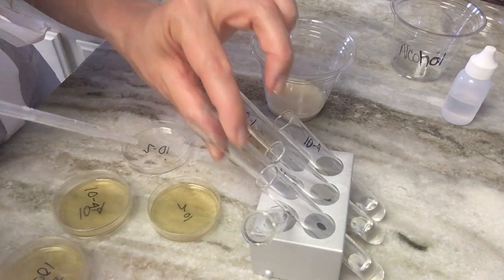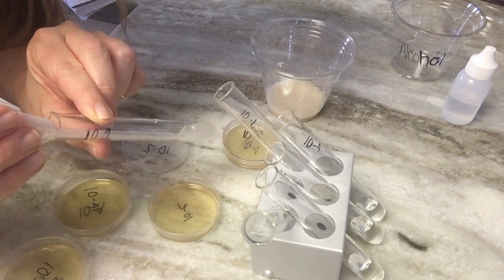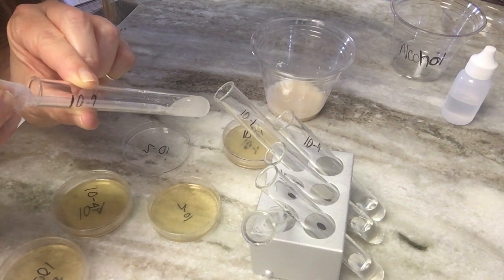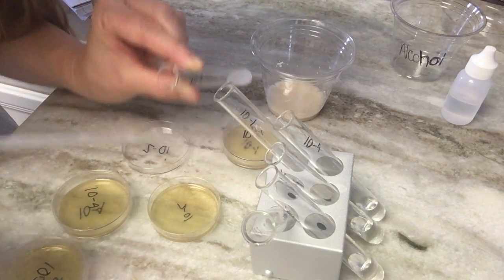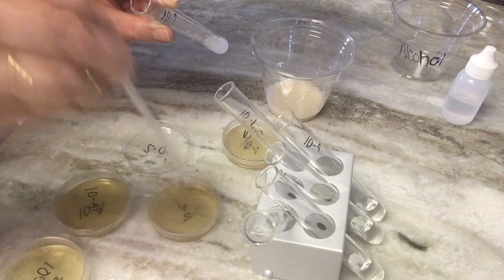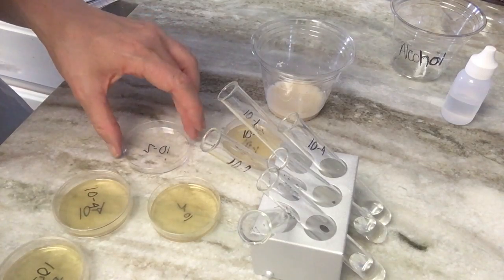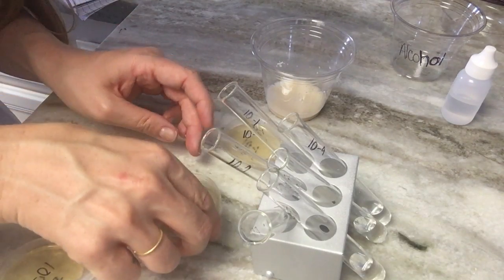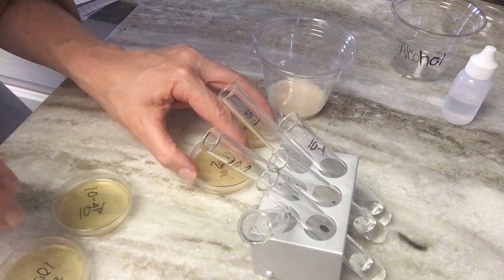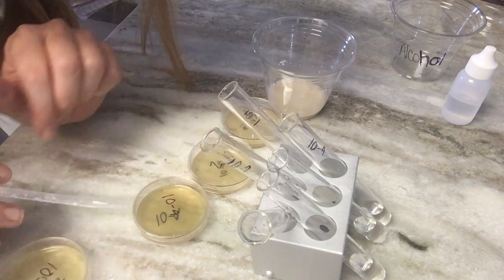So here we are with the test tube 10-2. Again, I kind of squeeze it out and push it back in. I want to see how much I get here. 0.125. Really shake it in there and put away my tube and cover my agar plate. This is going to keep going. Obviously, the higher the number, 10-6 will probably be the most diluted. But we don't know for sure.